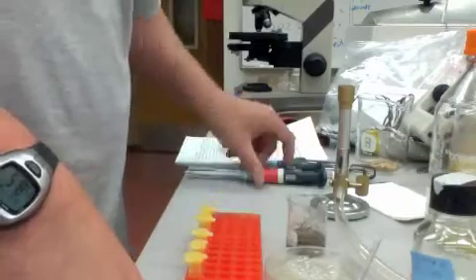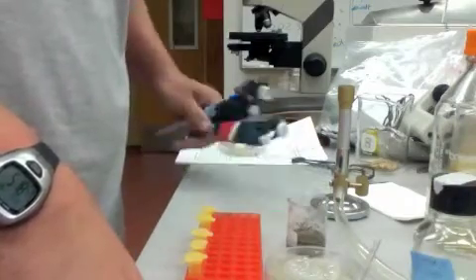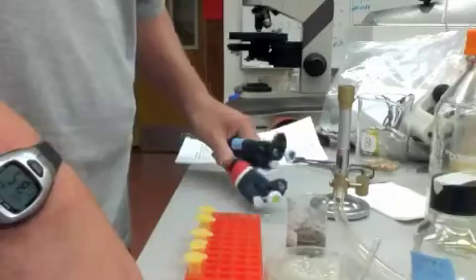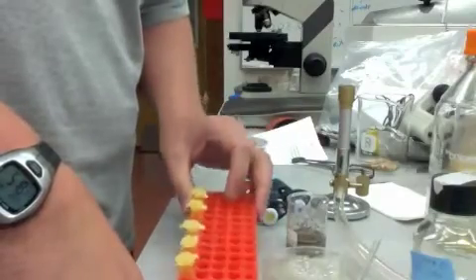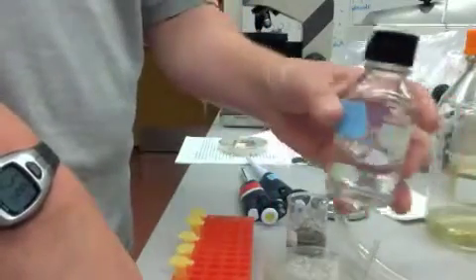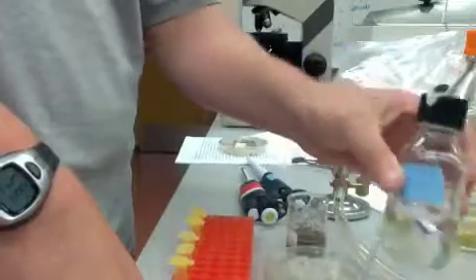And to do that, you basically are going to be given micropipettes and pipette tips and Eppendorf tubes. You will need some kind of diluent. It's either going to be sterile water or a phosphate buffer.